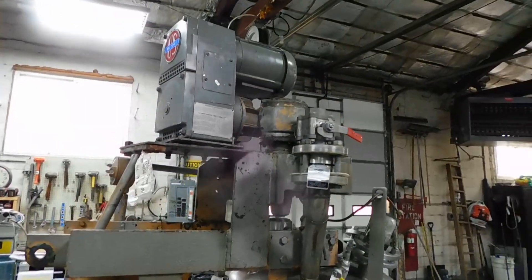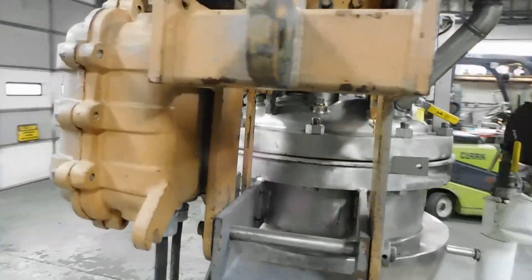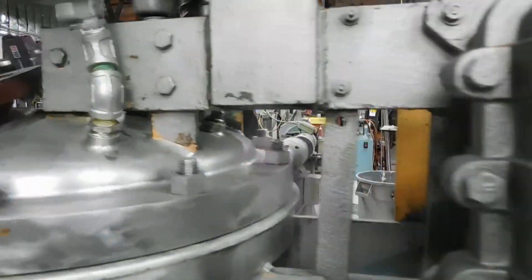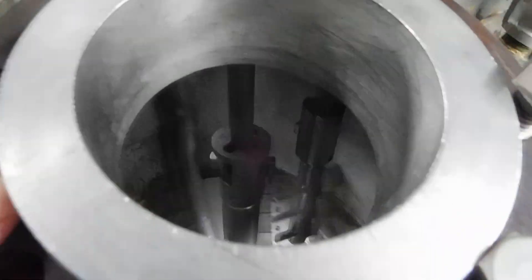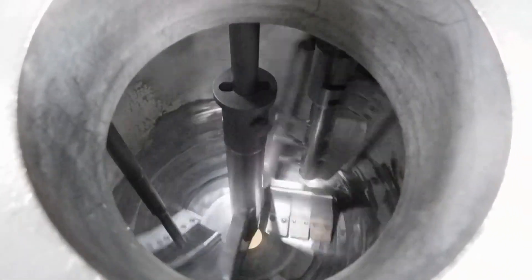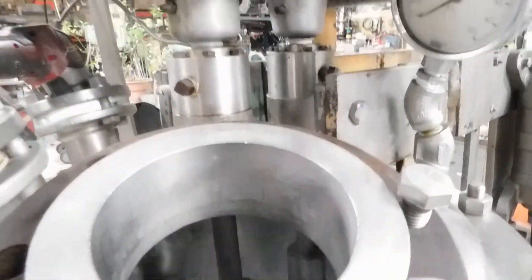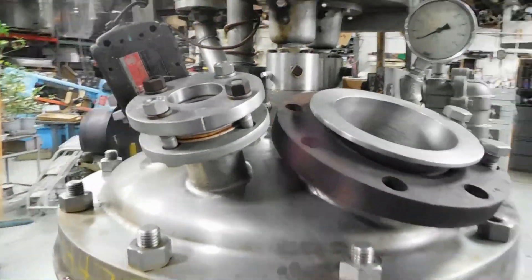It's operated by a small variable speed drive up here. It is all explosion-proof — explosion-proof controls. It has Groen's TA style agitator, with the secondary agitator and the scraper. Dual mechanical shaft seals, which are flushed. Two sight glasses.